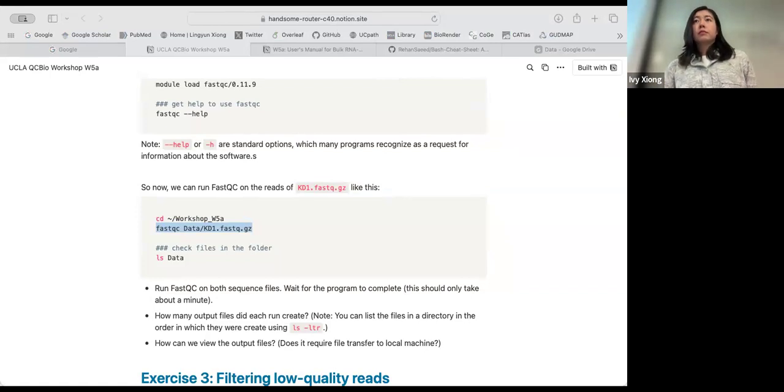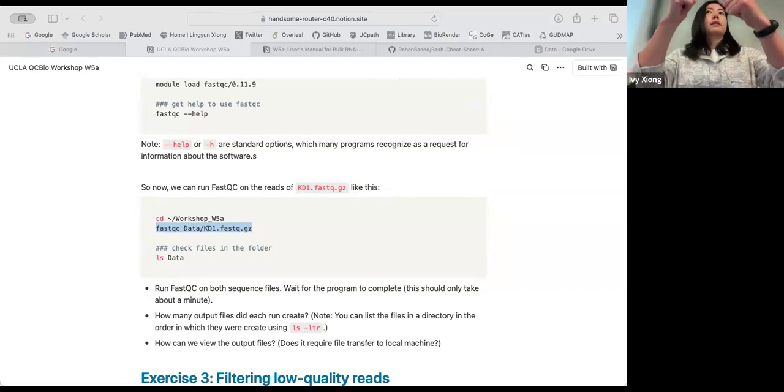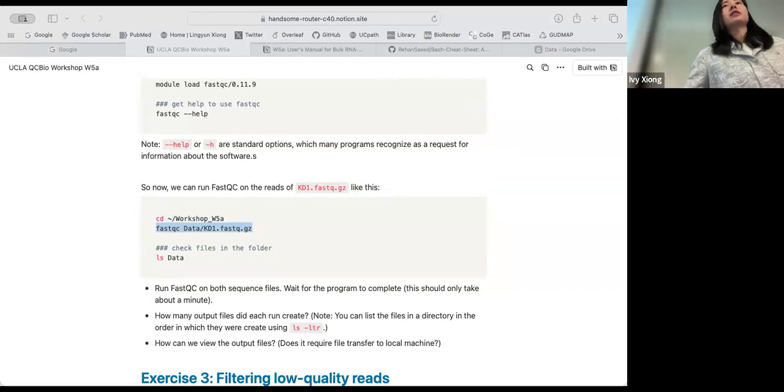No, I haven't done the zip one. Is that what you want? No, I have a zip file. Yeah, that means it ran successfully. Should I do the other one then? Yeah, you can try the other one.